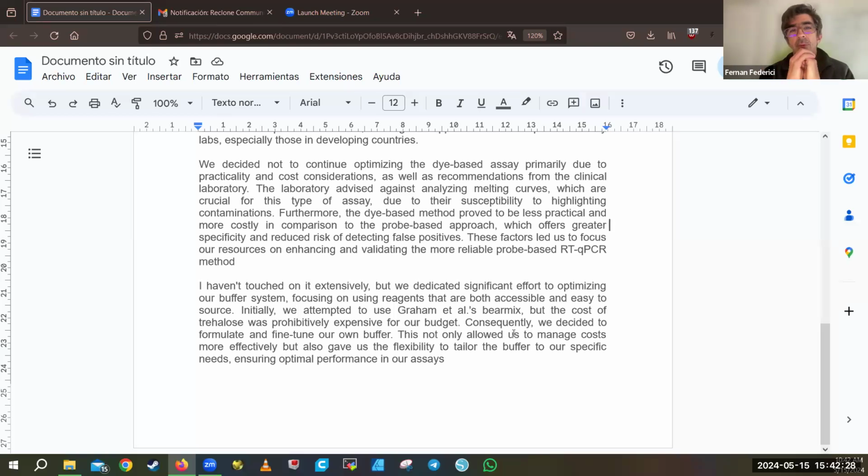And what Ariel did was to use some of the tags in the Reclone collection and make it work. And that was thanks to the existence of those tags, so we could rapidly make combinatorial assemblies and then try some of them. Some did work, some other didn't work.